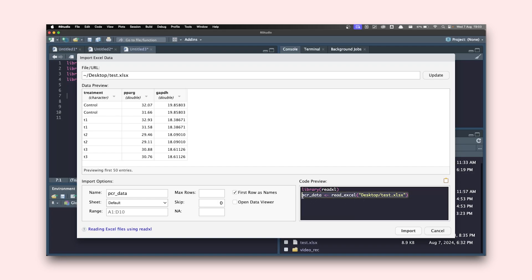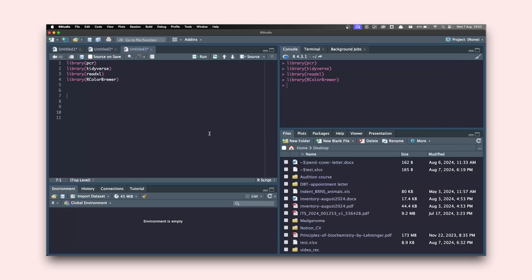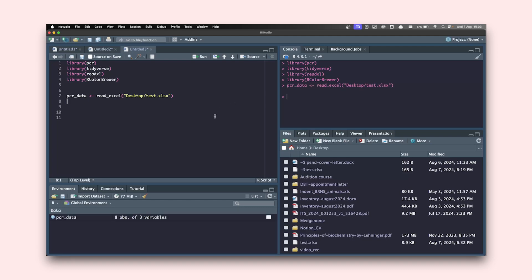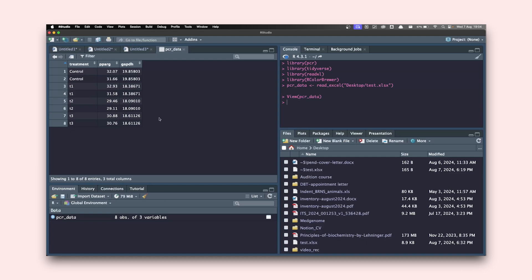I'll copy this code, cancel, paste it into the script, and hit Command+Enter. You can see an object has been added to your environment. If you click on it you're going to see the exact same table that you have in your Excel file.